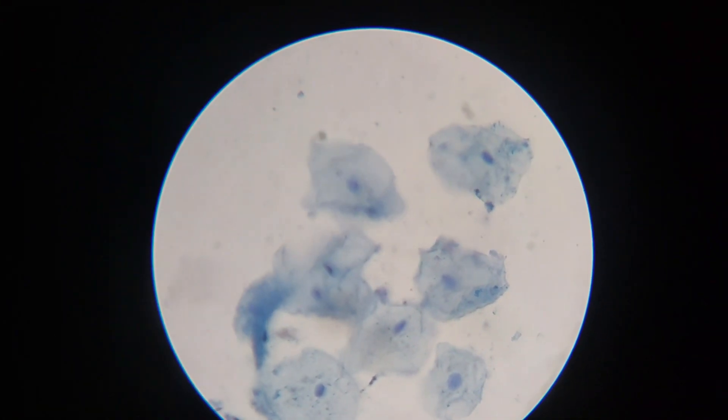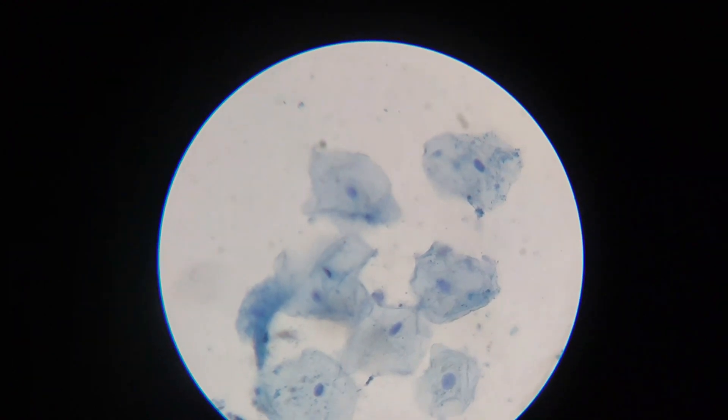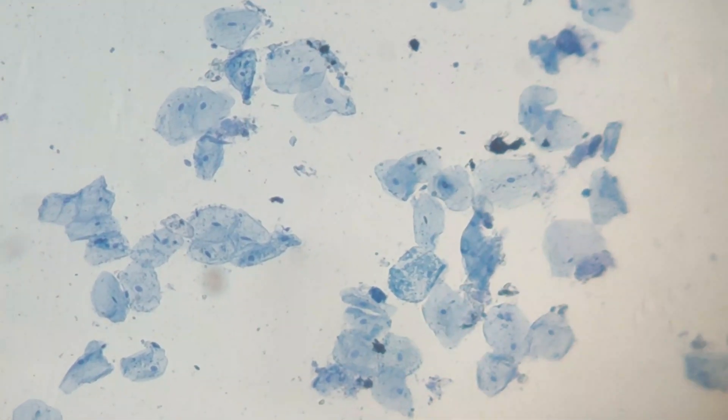Here you can see the pictures of cells under 10x magnification.